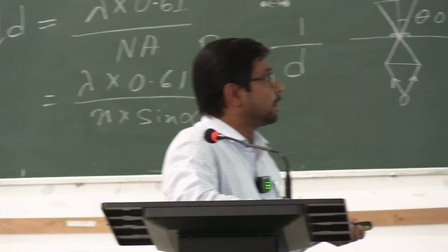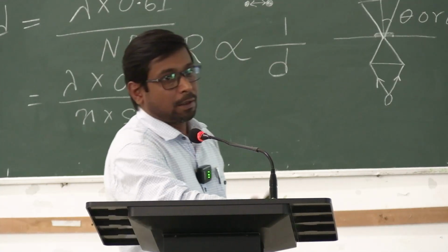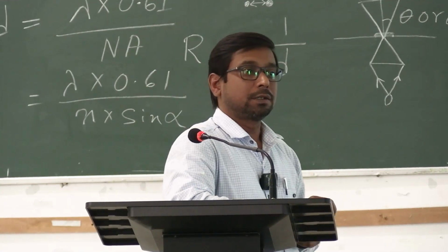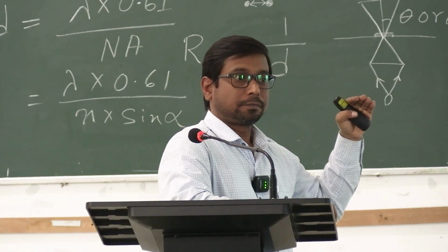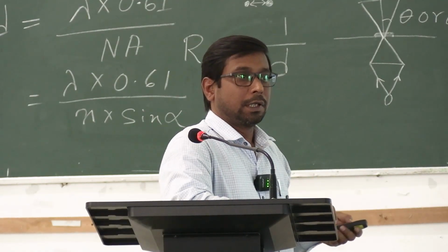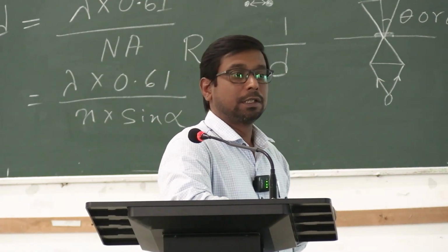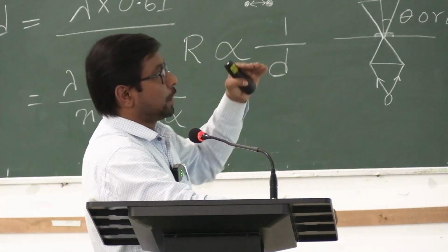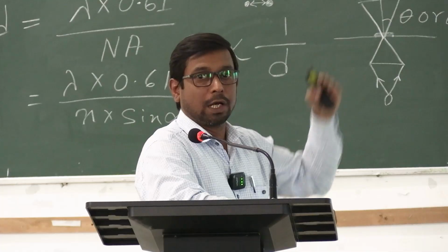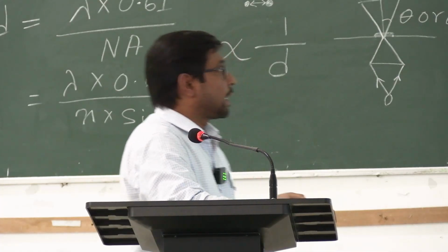We have the annular ring as well as the phase ring, and the phase ring is fixed where? The phase plate will be in the objective, or in between the objective and ocular lens.